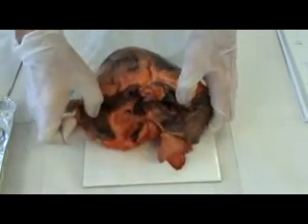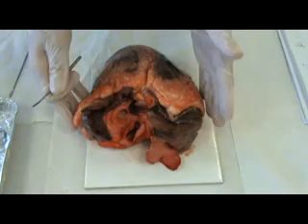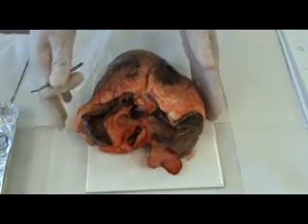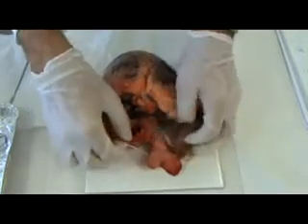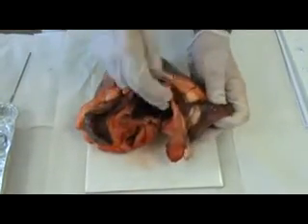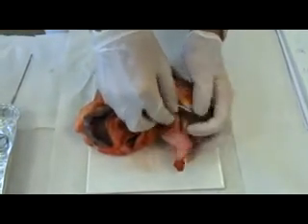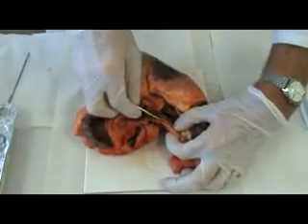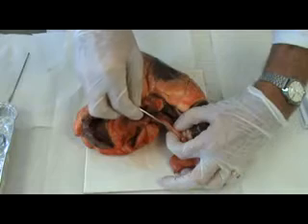First thing to notice is this is the left side and this is the right side of the heart. And what we're going to look for is the aorta, and there's a section of it there. And notice how thick that artery is.